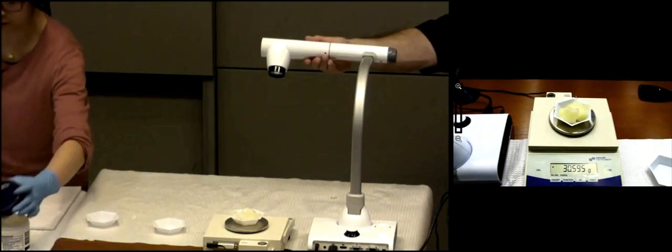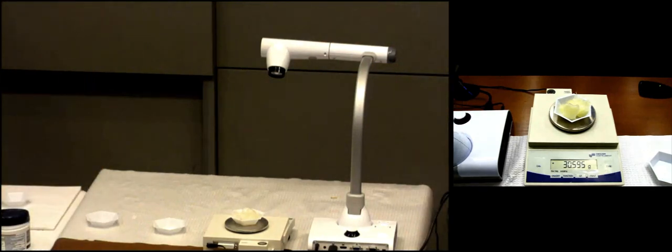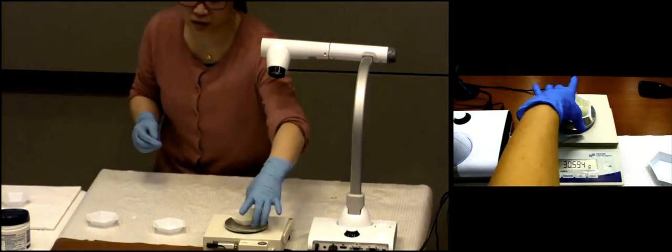Actual 30.595. 30.595 for the actual for the Aquaphor. Your spatula will be really hard to wash today because it's so greasy. That's why you want to use your tissue to just wipe it off. All right, this is ready.